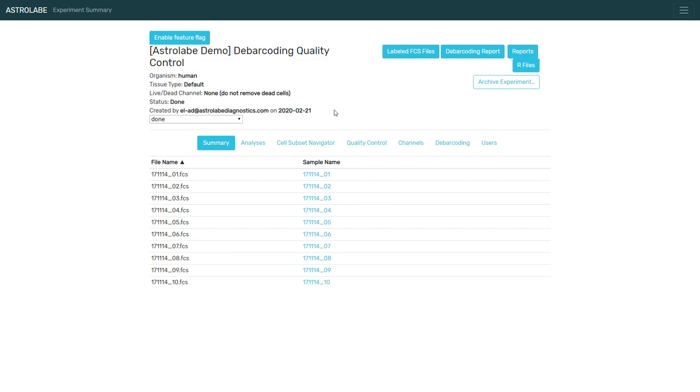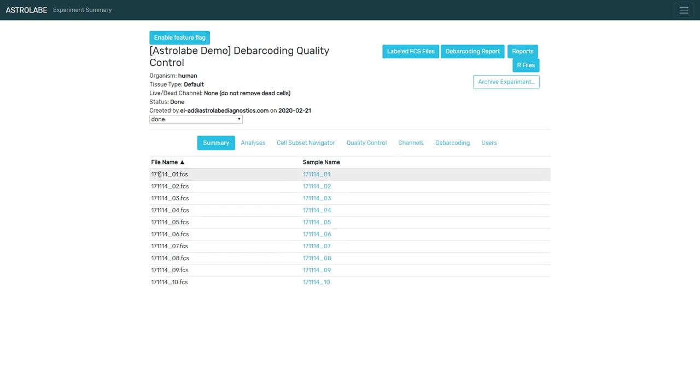When you debarcode an experiment using Astrolabe, the platform is going to make sure that all of the codes you expect are there. In other words, if you're looking for a certain combination of channels and we don't see it, then we will let you know that something is wrong.